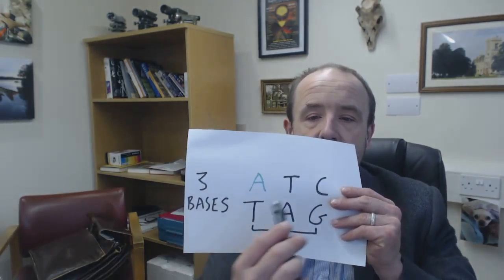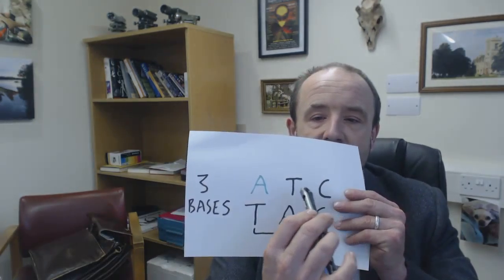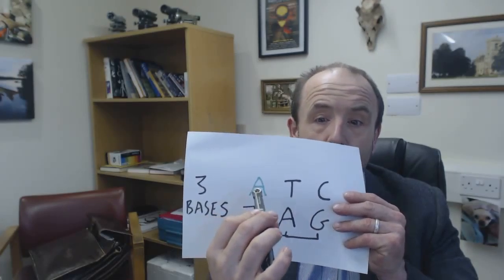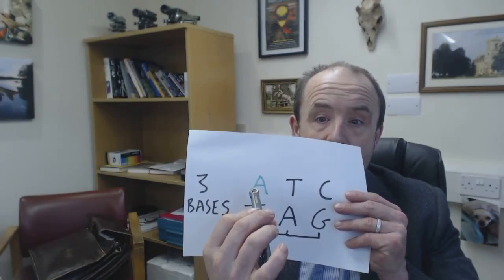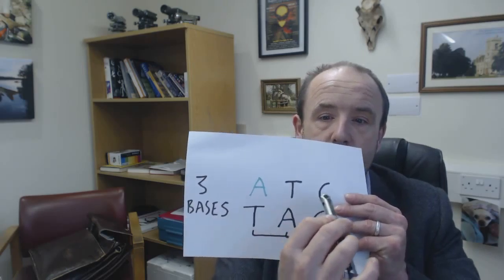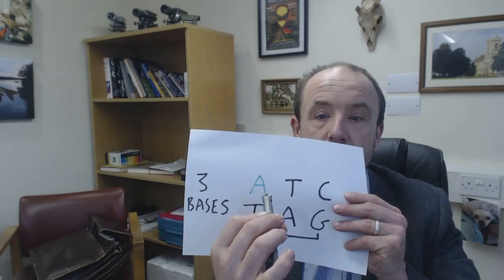And all other permutations have the potential of occurring, and indeed will occur. So for example, in this example we have a C-T normal bases binding before the inhibitory A base takes hold. So in this instance we have a molecule of 3 bases.